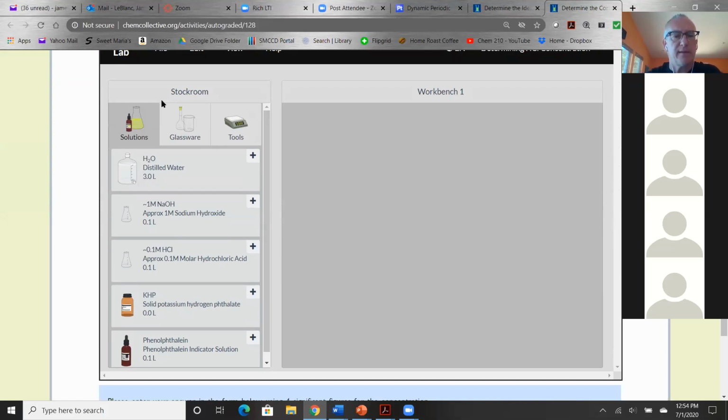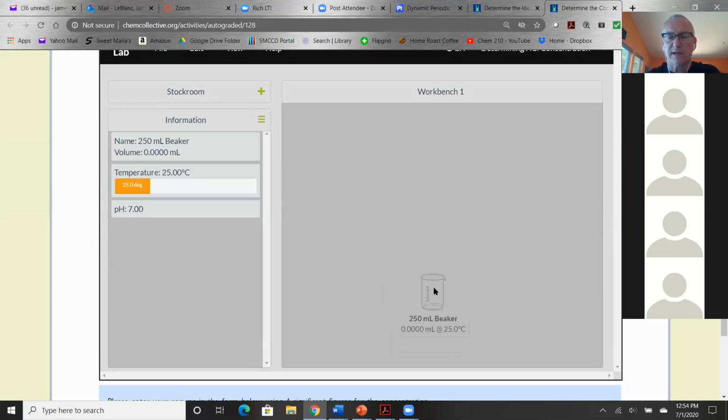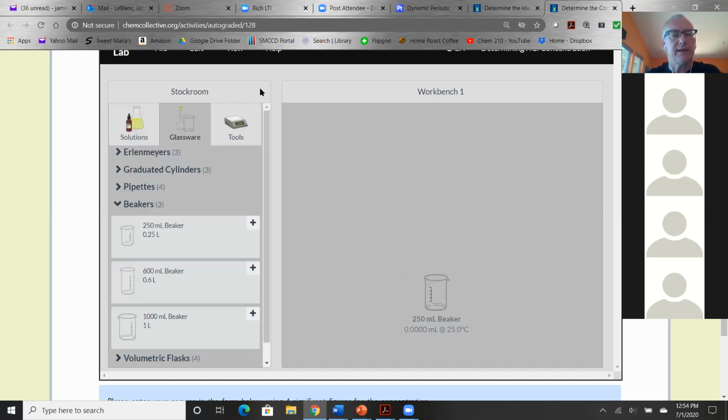So let's go to glassware, and we'll get our beaker. So we'll put that in here. That's where we're going to add our acid and our water. So notice when I click on the beaker, I get information about it. Its volume, none, and it's 25 degrees. That's another thing I want you to pay attention to. It'll give you the temperature of the reaction, and see if you notice anything about it, because it relates to something we'll be doing later quite nicely.